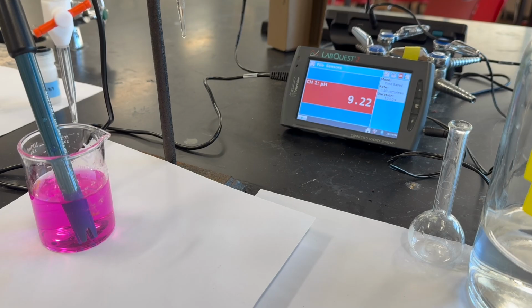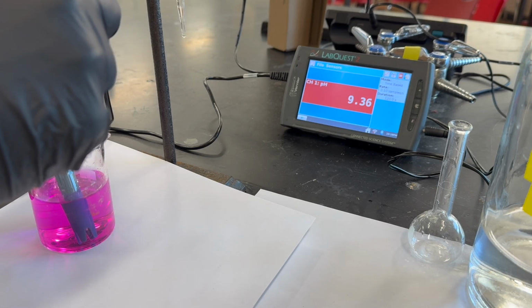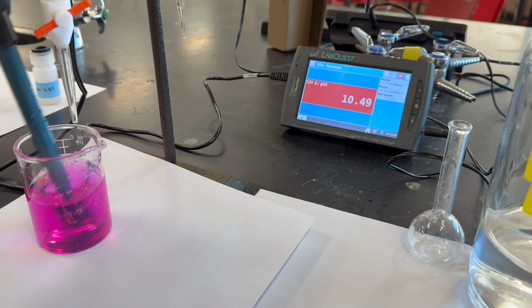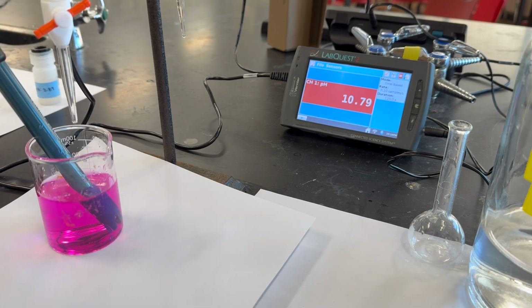Which is where we're at. And then we'll resume 1 milliliter increments at this point, until we get over pH 10, which we have. 10.78. So we're ready to go make this Excel graph of the titration curve.